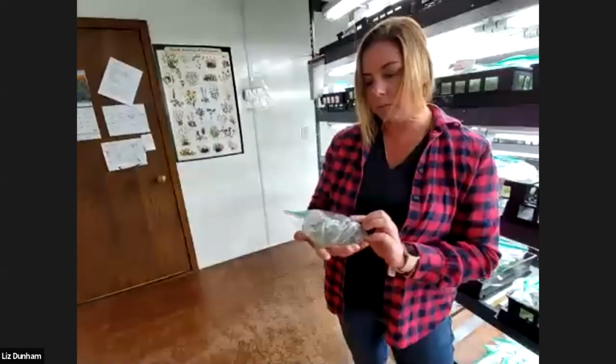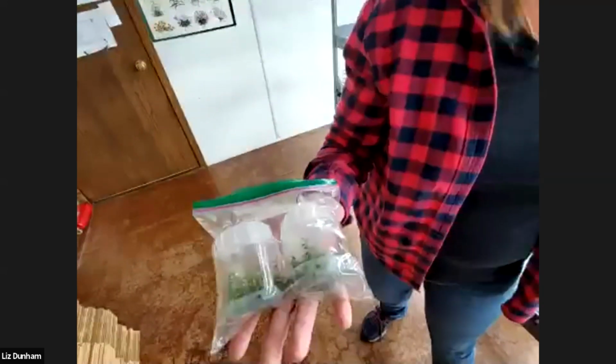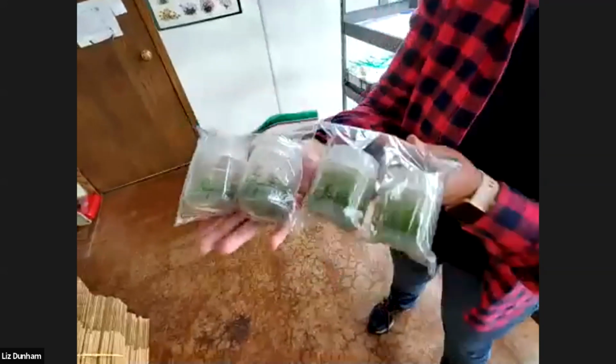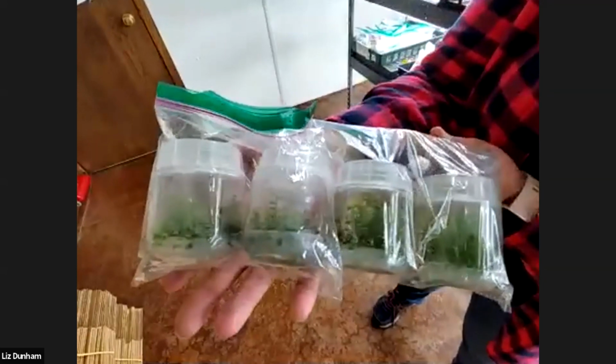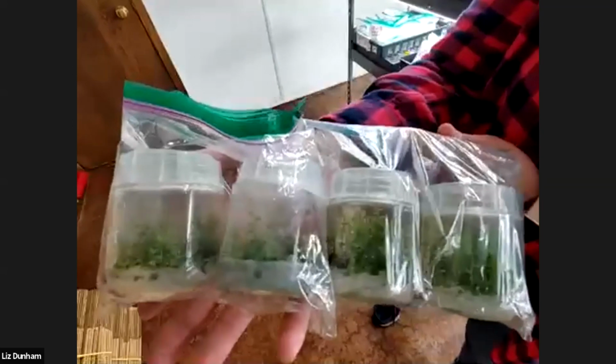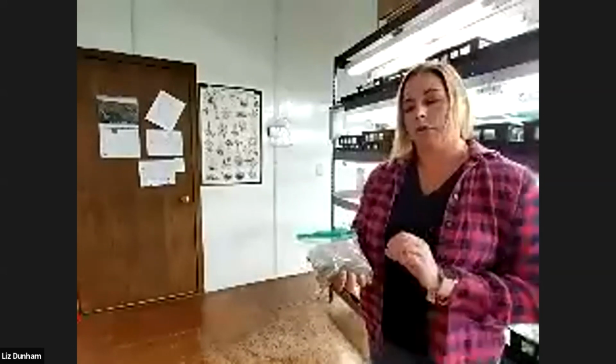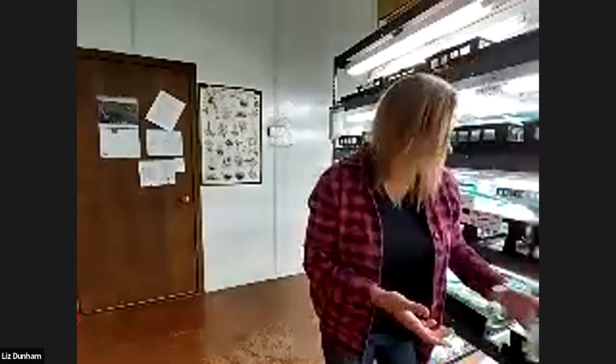This is actually another blueberry, and I wanted to show you this because this is the difference between, on your right is tip culture. On the left is what we call mids. We separate the tips and the mids in our culture. We realize that once you take a cutting, that top cutting is going to grow the fastest. And the ones coming after that that have the axillary buds are going to grow just a little bit slower.